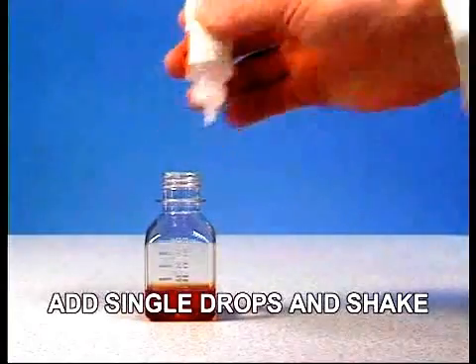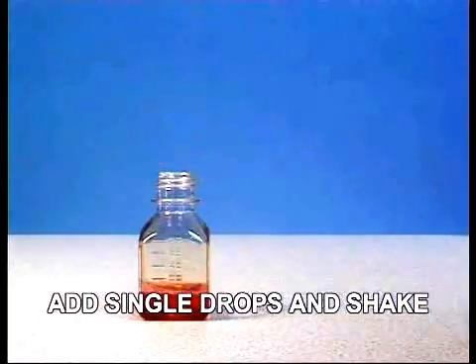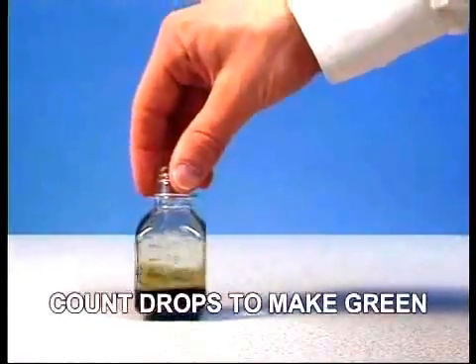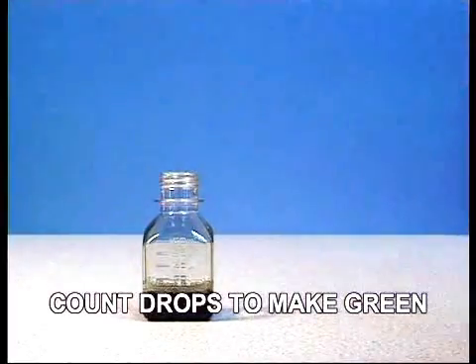Add TAN titrant one drop at a time to the test jar, swirling the jar between every drop. Count how many drops are used to turn the sample from red back to the green you started with.